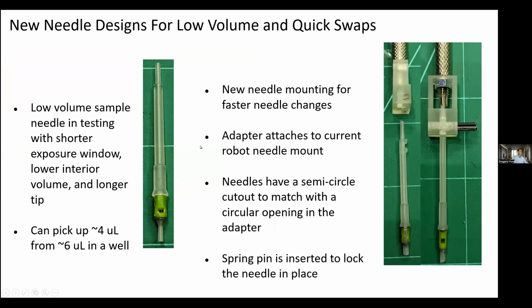So moving on, we do this by making a liquid handling robot carry needles that have an X-ray transparent window. We just suck up samples and they go into this spot. X-rays get shot through there. And we're really working hard to reduce the volume required. So we have these low volume needles, and I think we're going to move to the low volume needles going forward. We've tried other designs with other tricky components, which I won't get into.